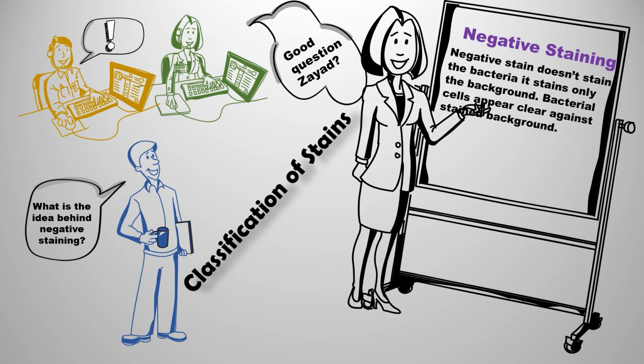Negative stains do not stain the bacterial cells, as we said. They stain only the background. The bacterial cells appear transparent. It also tells us something about the morphology of the cell. There are no inside details, you cannot see them, but you can see the size of the cell and how they are arranged.